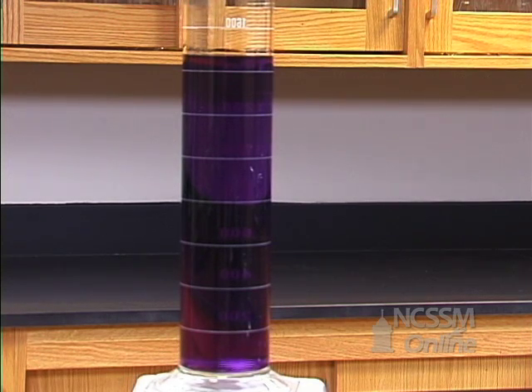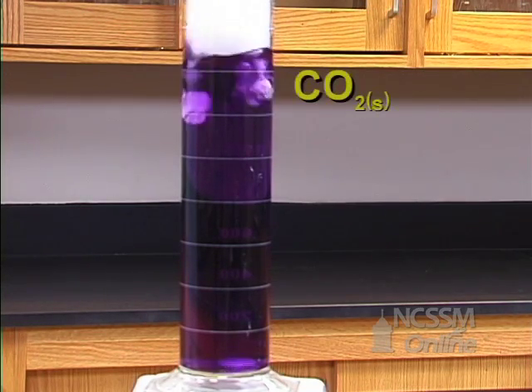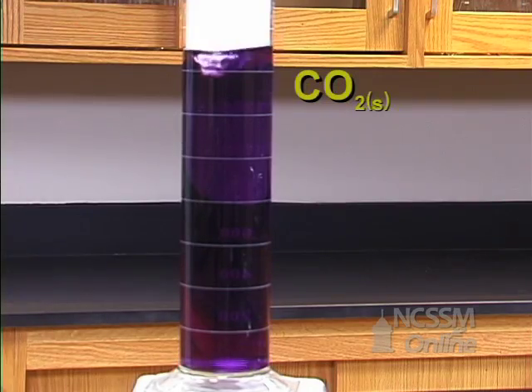As the carbon dioxide dissolves in the water, it will produce carbonic acid. The pH will go from a high pH to a low pH, and we'll see the color range for universal indicator.